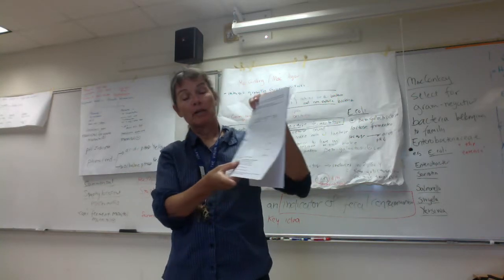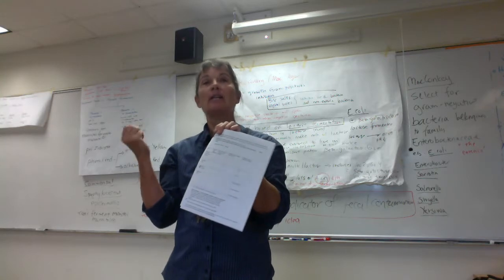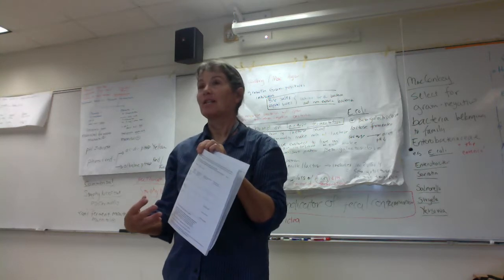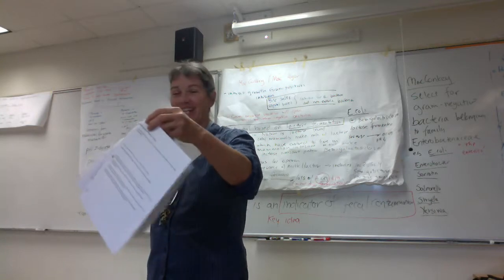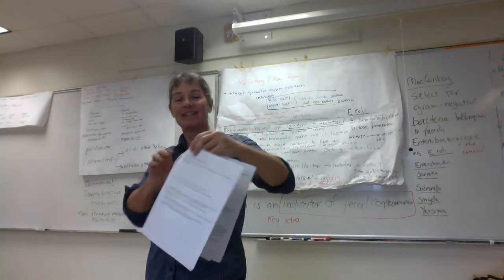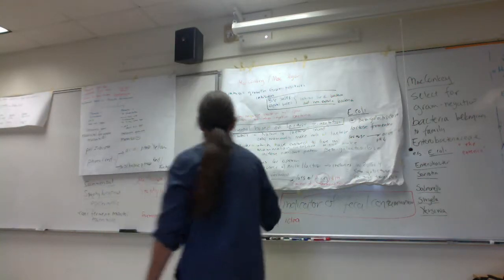And then down at the bottom there, you guys, this whole discussion on E. coli is an indicator of fecal contamination. That is a key concept, you guys, that E. coli is an indicator of fecal contamination. So if you're having trouble digesting that, just keep asking questions. And then, folks, it finishes on page 6 on blood agar, okay?